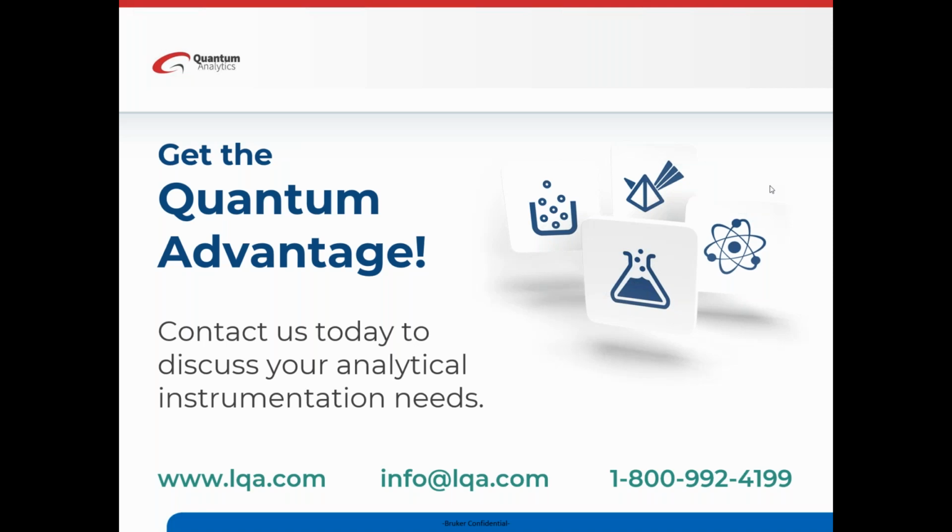What I typically tell people is, in general, when you go into a lab, if you just put your hands quietly onto the table and feel a lot of vibration, then you might want to have some vibration dampening mechanism, maybe some mouse feet, or a mouse pad underneath it, or something else. But by and large, these are very, very robust instruments with respect to vibration. In fact, I take them and put them in my vehicle, and then in my backpack, I take them out to caves to make measurements, and even the microscopes I've done this with, pretty much out in the field. So they are very, very durable and very free from vibration interference.